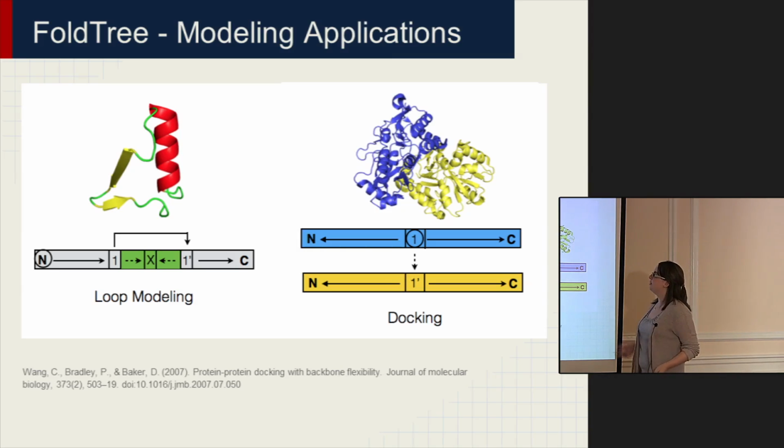My favorite example is in docking. If you want to relate two separate structures or two chains and you want to dock them together, you can do this by adding a jump from the center of mass of one structure to the center of mass of the other to relate the two. That's just one example. There are lots of others, and you also get to play around with it in the lab a little bit later.